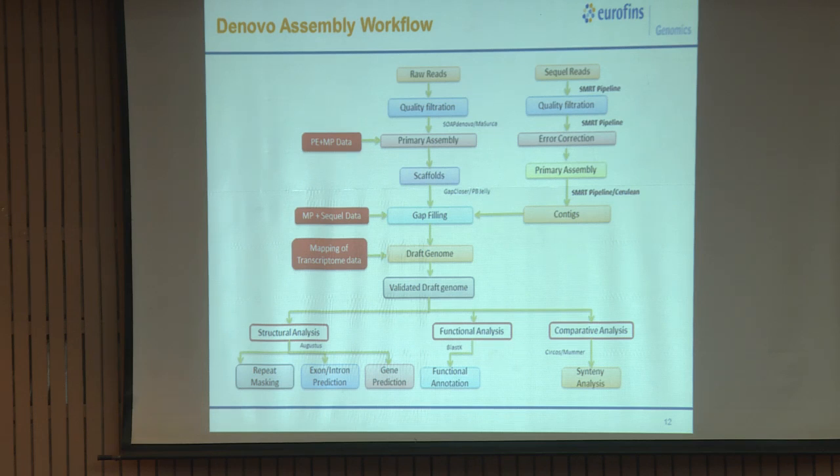Now, the PacBio platform filters the data and gives it to you using SMRT Analyzer, which is already there in the system. So, it filters the reads based on quality and gives them to you. All the bases in the PacBio read will be of the same quality, right. So, you do not have to filter it based on quality.